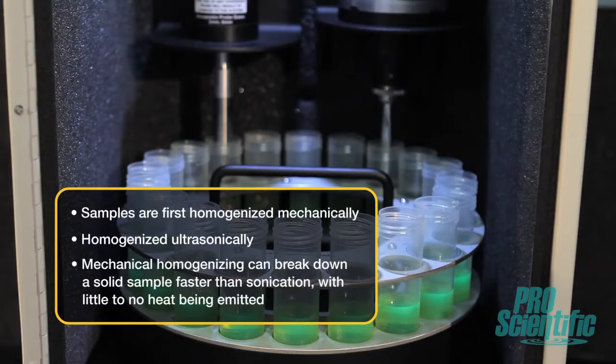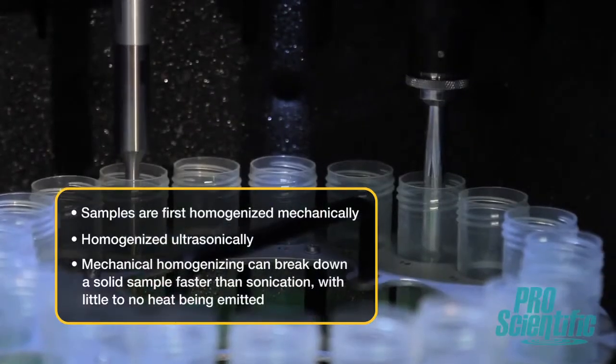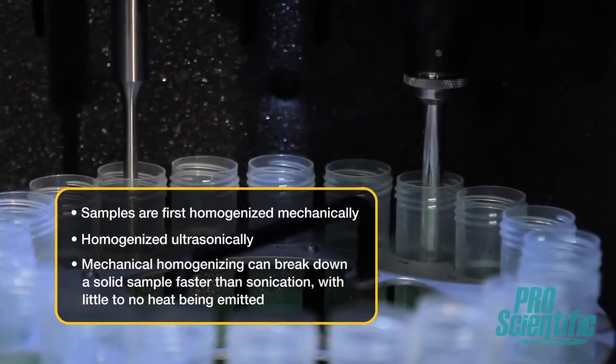In this mode, samples are first homogenized mechanically, and then homogenized ultrasonically. Mechanical homogenizing can break down a solid sample faster than sonication, with little to no heat being emitted.